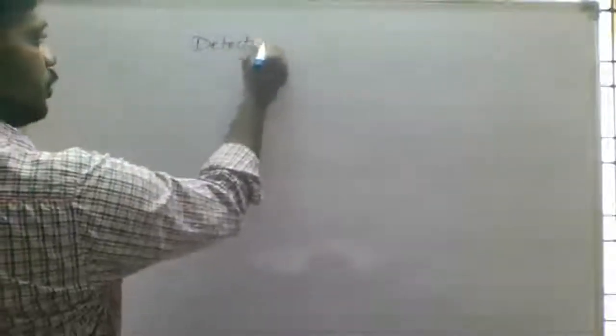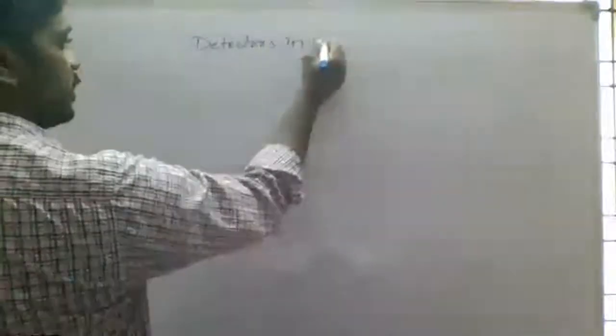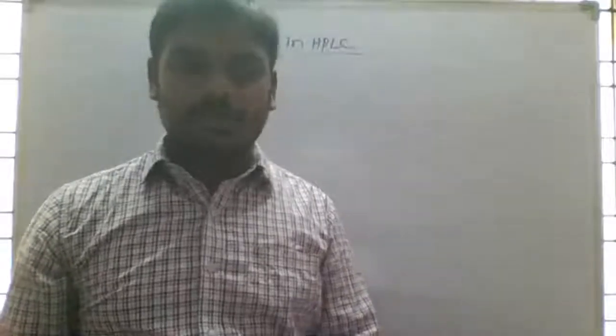Good morning. Now I am going to explain detectors in HPLC. Detectors in HPLC. The first detector is the UV detector. One of the most important detectors is the UV detector.